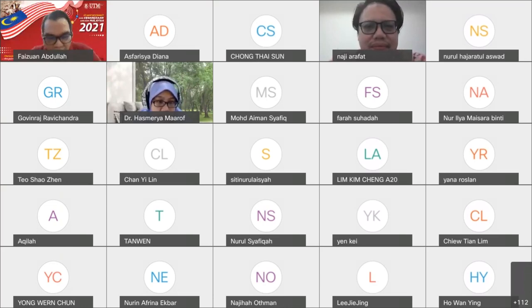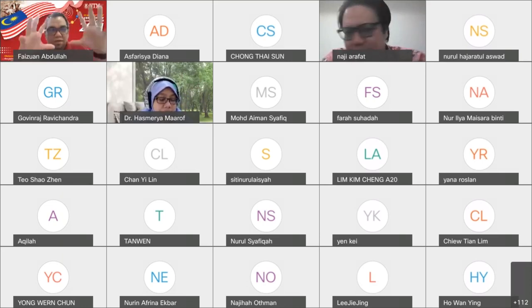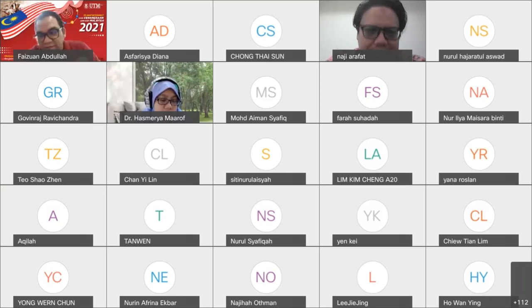Okay, I would like to add some more. If you remember, we are analyzing the water samples, right? Meaning that the water samples contain nickel. So we need to analyze how much nickel is contained in the water sample itself. Naturally, the metals in the water are not all in the form of free ions. Some of them are in the form of precipitates originally.